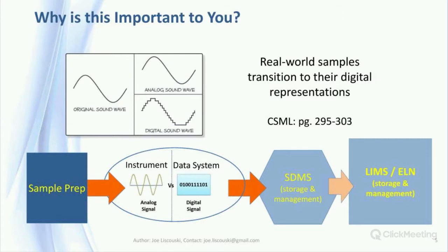My point in this next session is not to tell you that your data and its processing are wrong, but rather that if you don't do your due diligence, you don't know if it's right. And by right, I mean that it's an accurate representation of the instrument's output and the sample characteristics you're measuring.